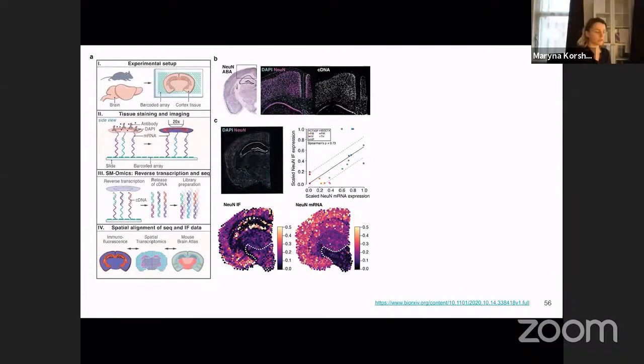Then you do staining and mark your sample with some fluorescence molecules, in particular in this case DAPI, which is used for highlighting the sites of high content of adenine and thymine. So in general, you do some kind of immunostaining, immunofluorescence, sorry.